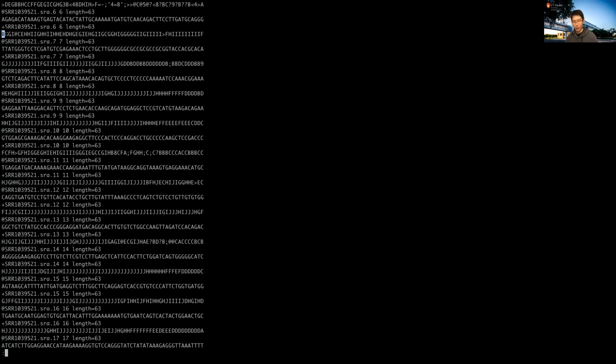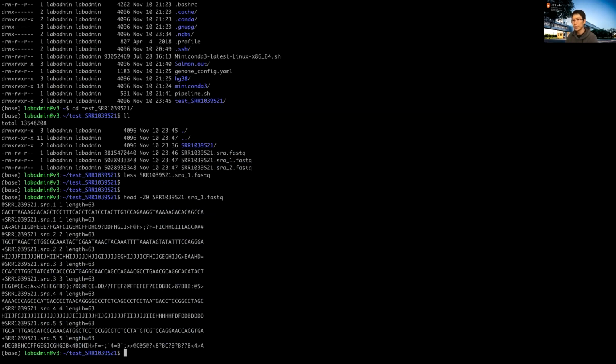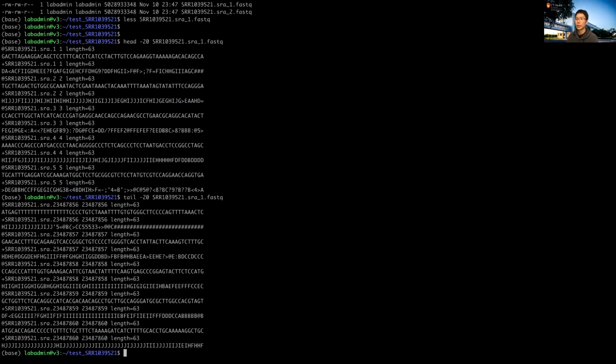Okay, so we just did less on this file, so you can look at the file. If you want to quit, just press Q, a single Q, and you go back to the original directory. Another two ways Dr. Feng introduced last week: you can do head with dash 20 lines of this file to view the top 20 lines. And you can also do tail, 20 lines, and it shows the bottom 20 lines of this file.